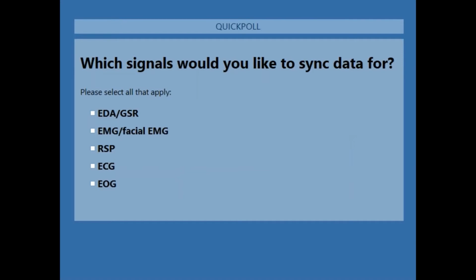Are you ready? Yes. Would like to know what considerations should be given to environmental conditions when setting up experiments, light levels for pupil data, ensuring consistency, and best research practice with respect to other physiology data collection methods. Yeah, that's a great question. I can address that.